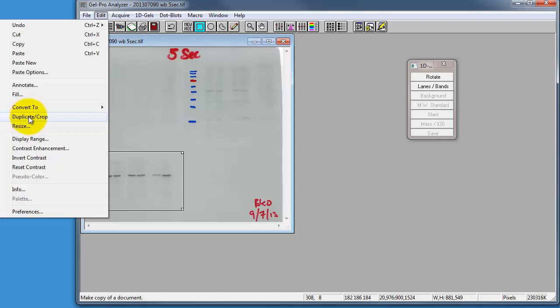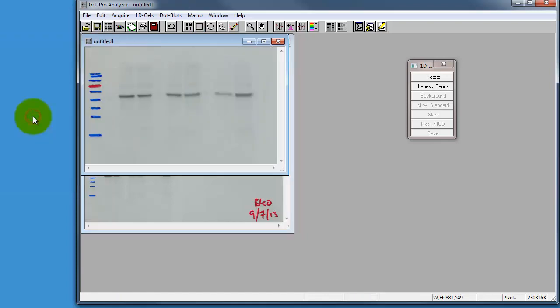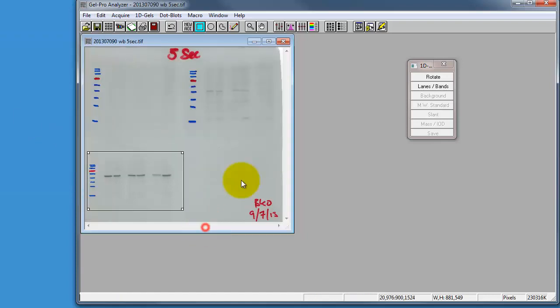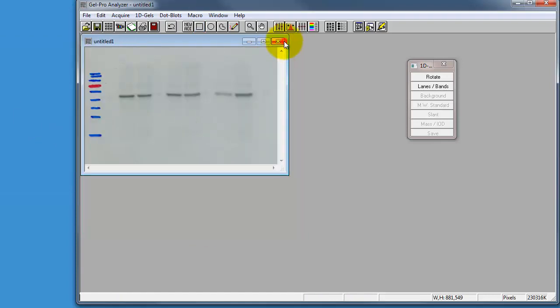What it will do is make a copy of this entire image and crop it down to the right size. So there we are, it's now cropped our image. I can just go around and close the back one in the background.